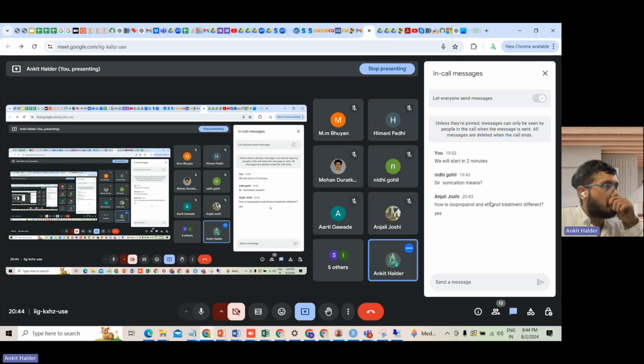Okay. So now, for instance, you have done the TRIzol extraction, you have solubilized the protein and you have got the protein precipitate. Now tell me, what would be our next step after we have got the protein? Anyone? Or you can write in the chat box as well. So after a lot of hurdles, you are working with a very challenging sample.